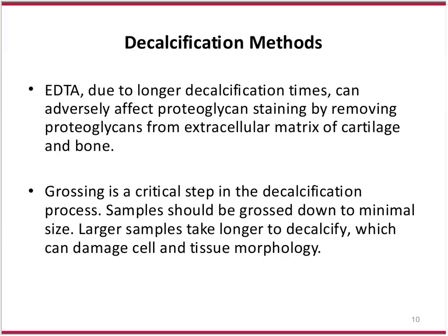So we actually right now in our lab have samples coming in from a surgeon, but they're cadaver shoulder rotators and rotator cuffs, and they're humerus and rotator cuffs. So what we're doing is taking a larger section of these samples, starting to decalcify them for 1 week, and then grossing them for another week, and they're easier to handle, and we find that we aren't damaging the tissue.